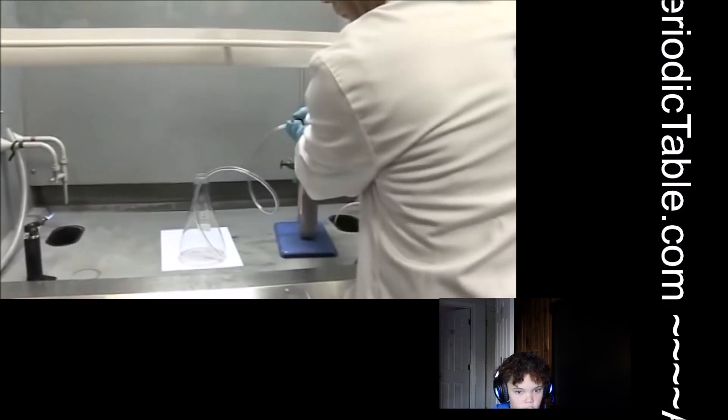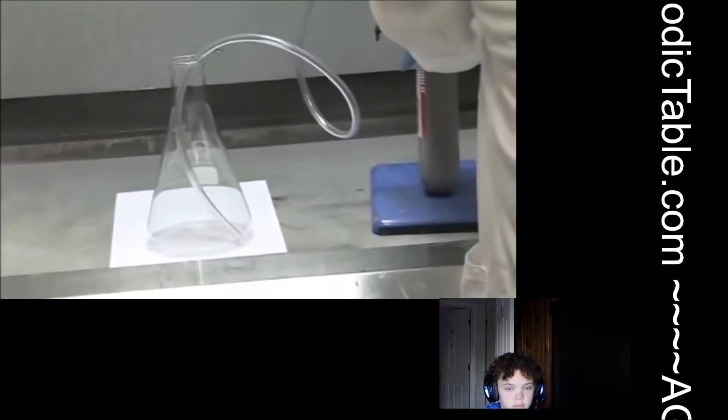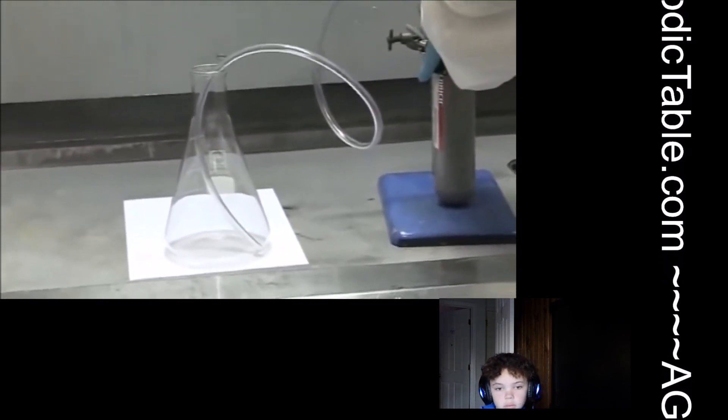Okay, so Neil is about to open the cylinder of Chlorine to allow some Chlorine gas to leak through the pipe into the flask in the fume hood.